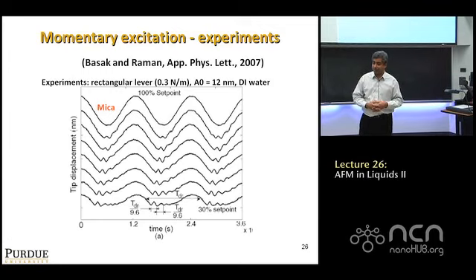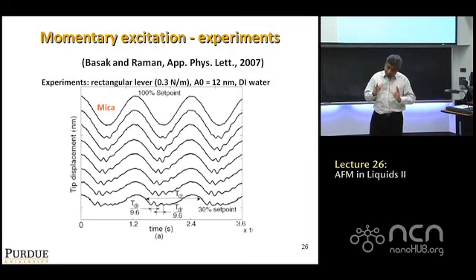Another way is to say, I'm not going to measure how high it bounces back, but I'm going to listen to the sound. So I bounce it off a soft substrate, and I hear the sound. And remember, the sound comes from the fact that after collision, the internal degrees of freedom are ringing, right?